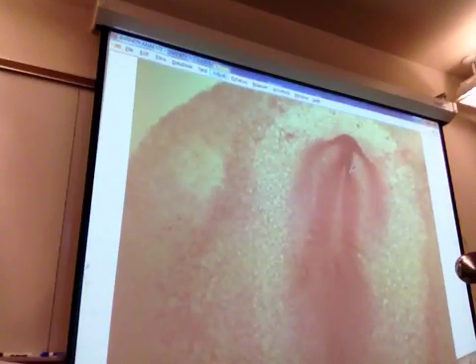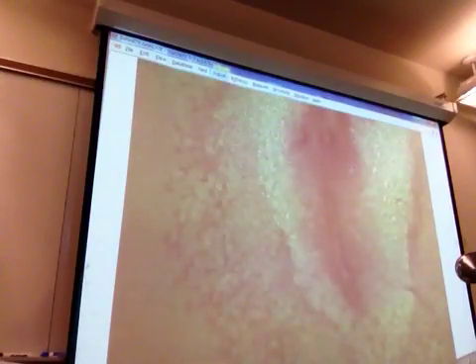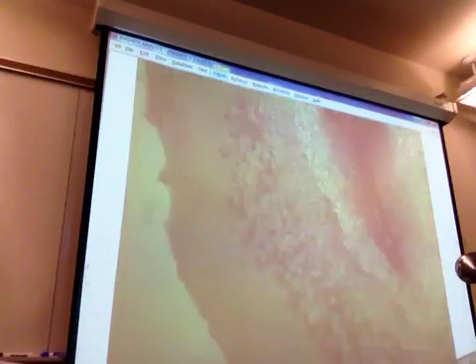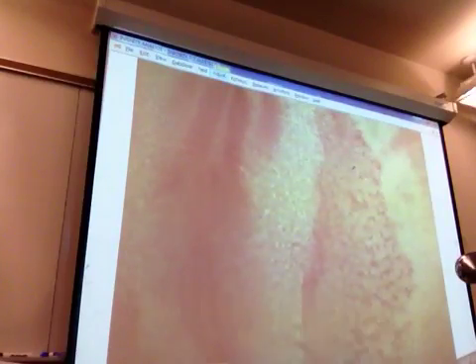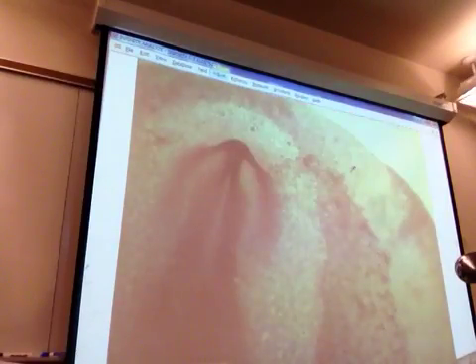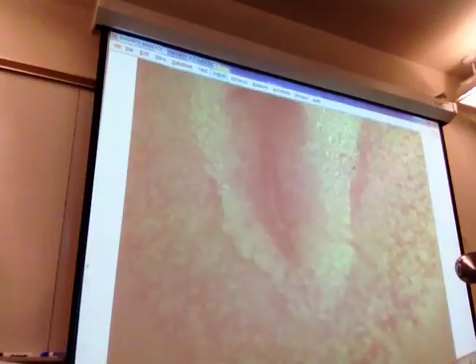Well, there's the little chick. Is that a dorsal view? This is actually an overhead view. It's like if you had it mounted, you windowed the egg and you're looking down from the top. This is 20 to 22 hours.